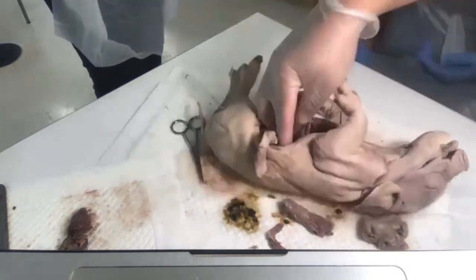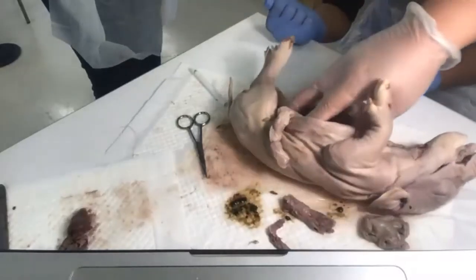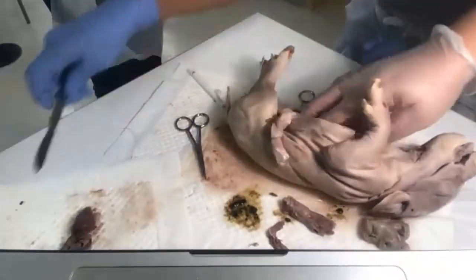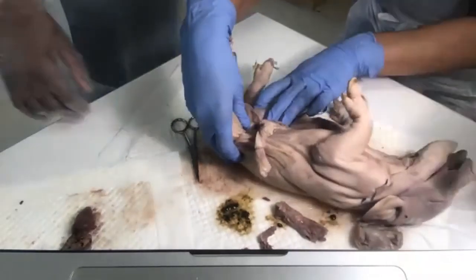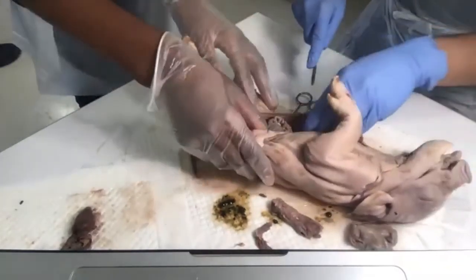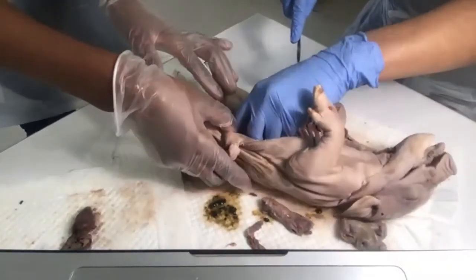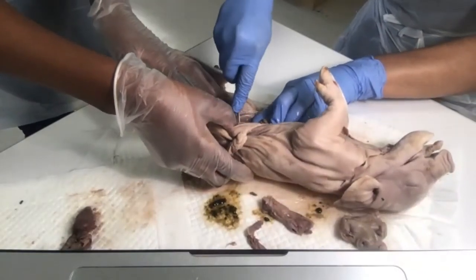And let's talk about the last thing, and we can call it a day. Who's next? All right. Take all this tubing out. You have small and large intestine, and then we're going to open it up and we're going to look at the difference. But right off the bat, I know I probably only put up a video for my gastrointestinal. Right off the bat, what's the difference between the small and large intestine?